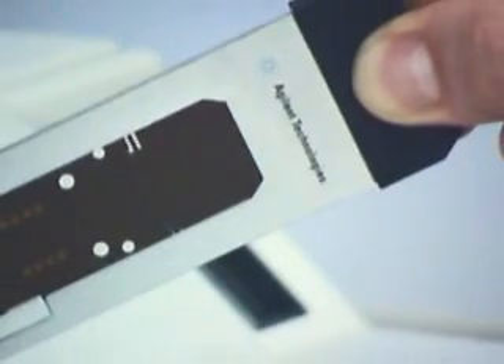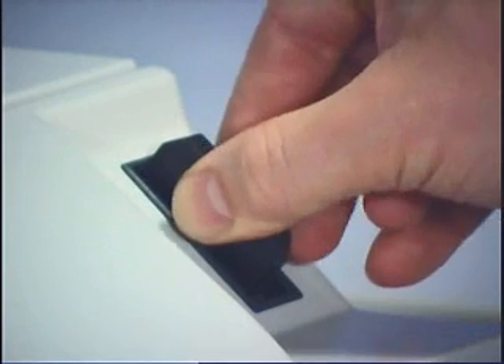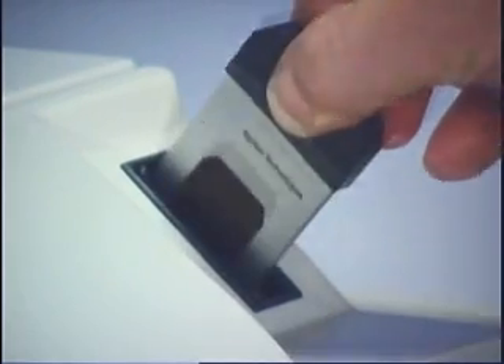The first component of the system, the Agilent HPLC Chip, integrates enrichment, separation and spray formation on a polymer chip smaller than a credit card. The compact chip architecture reduces peak dispersion and combines all steps from sample loading through compound ionization.